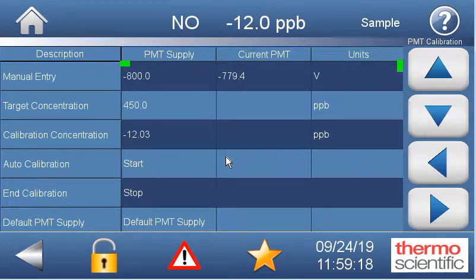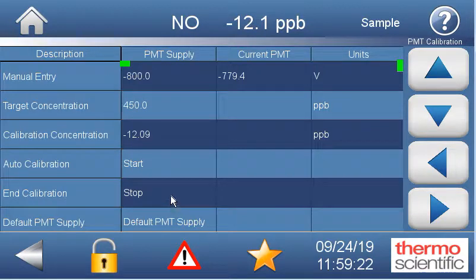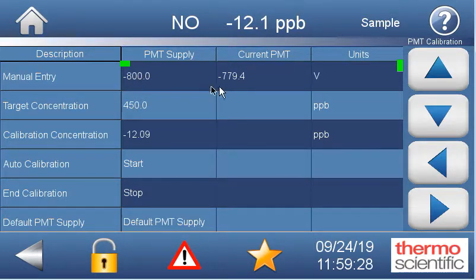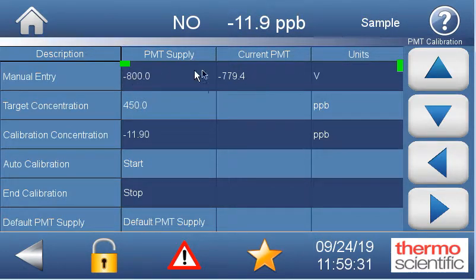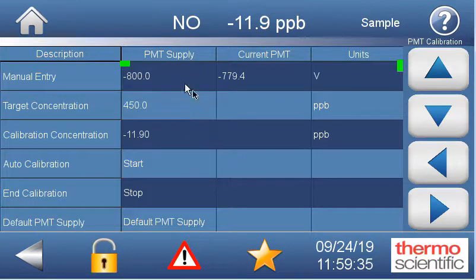If you get a fail, it's going to pop up — try running it again. I'm not sure the reasons why it fails, but if it fails, it fails. If it's a big change, so if this jumps a lot — maybe 20 or 30 volts or more — that can affect your baseline.